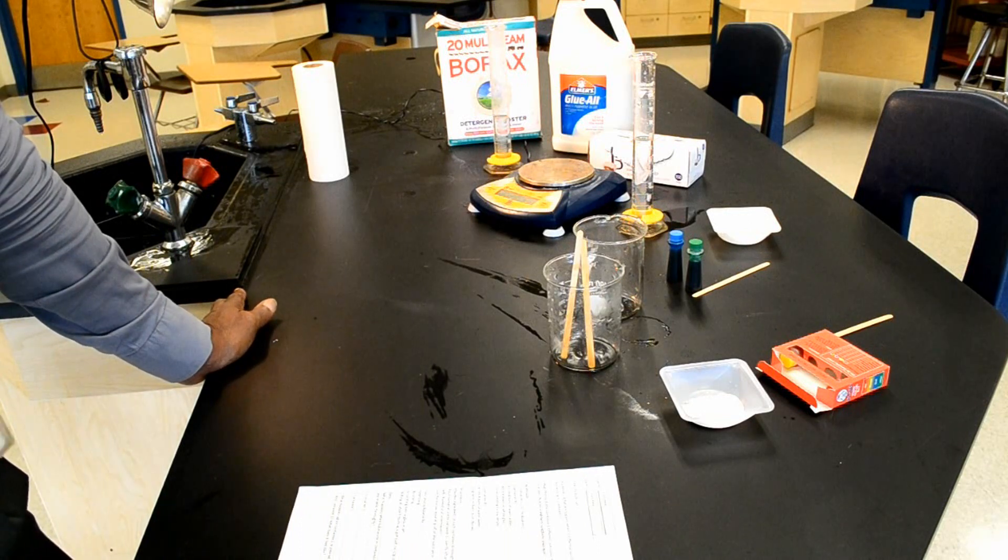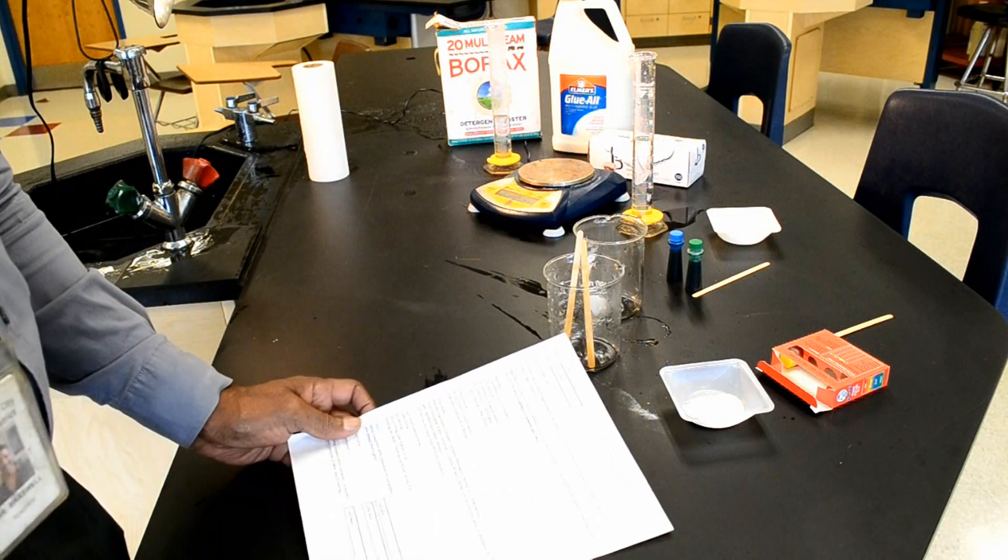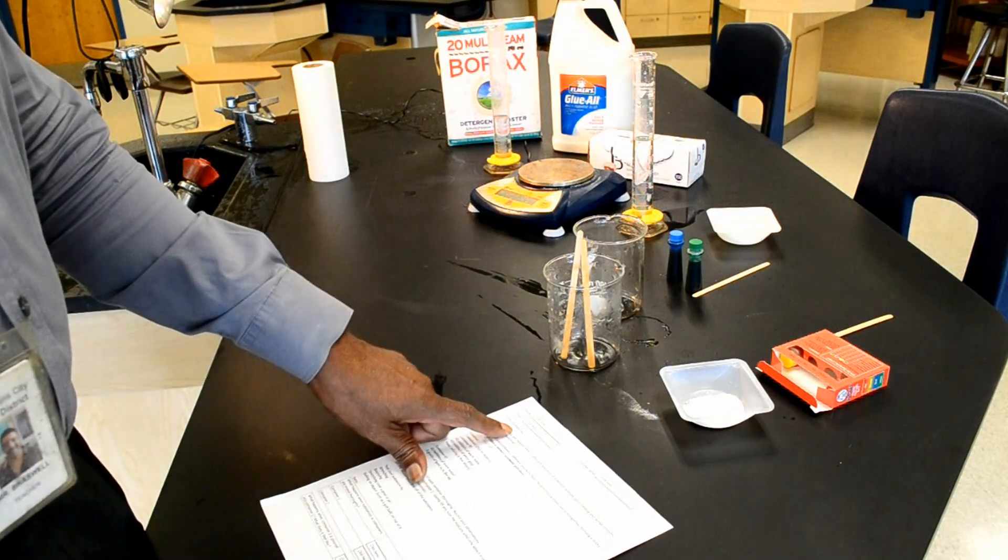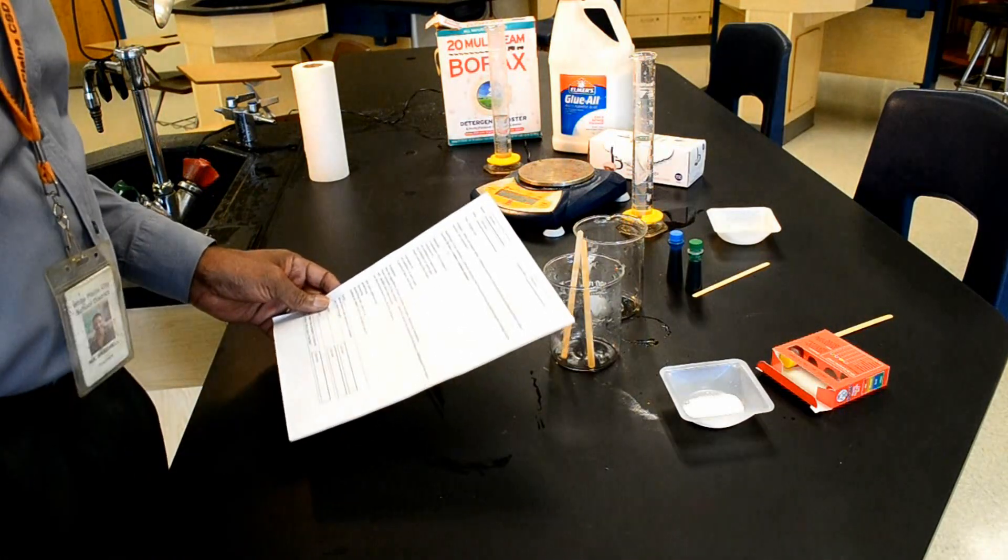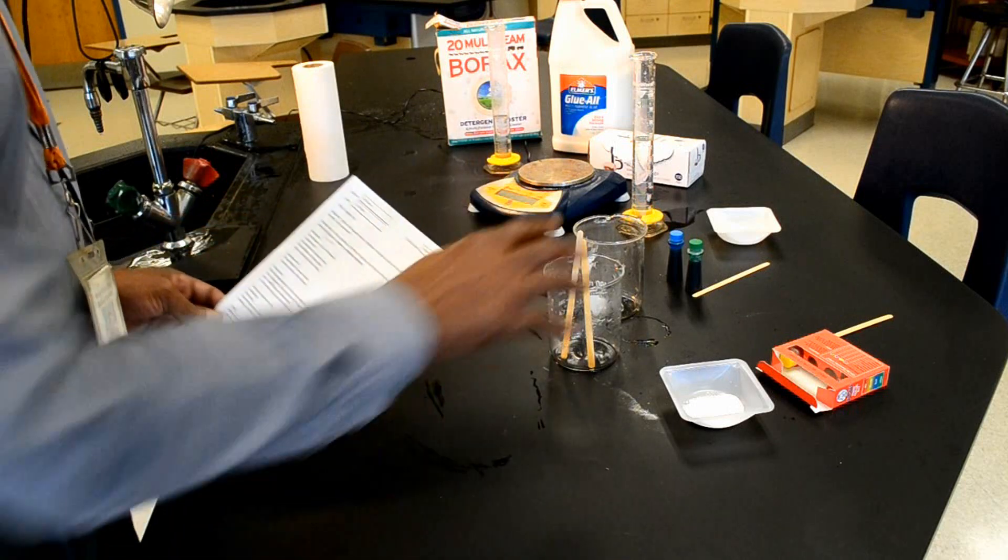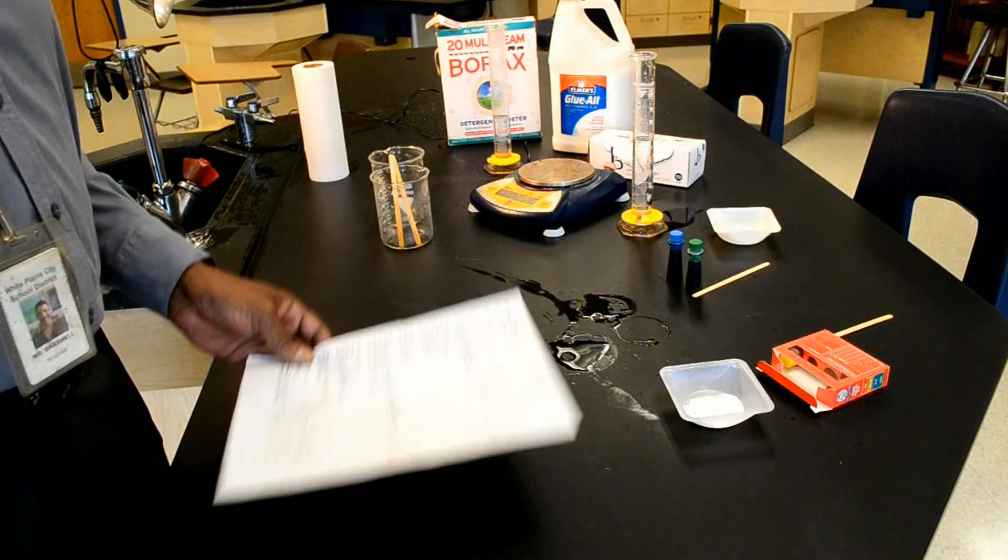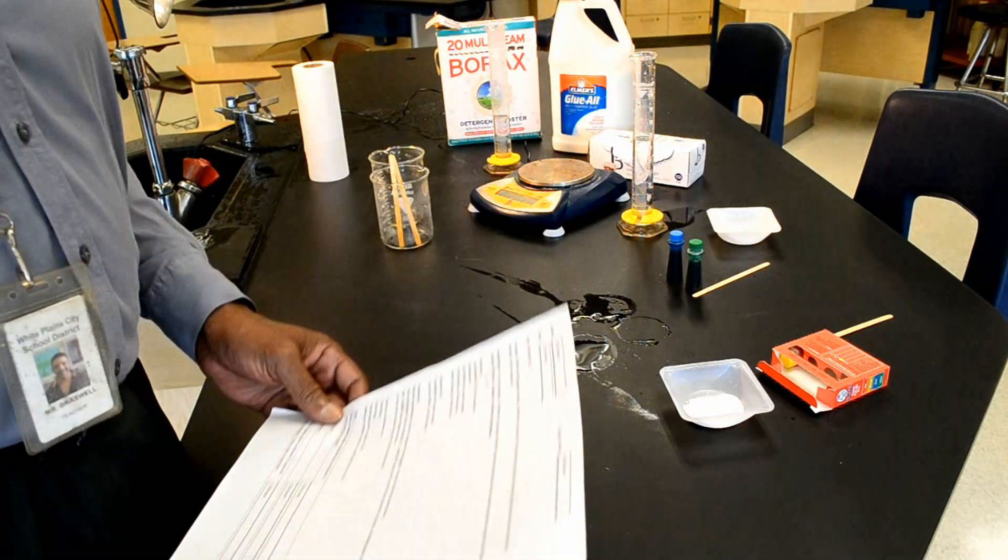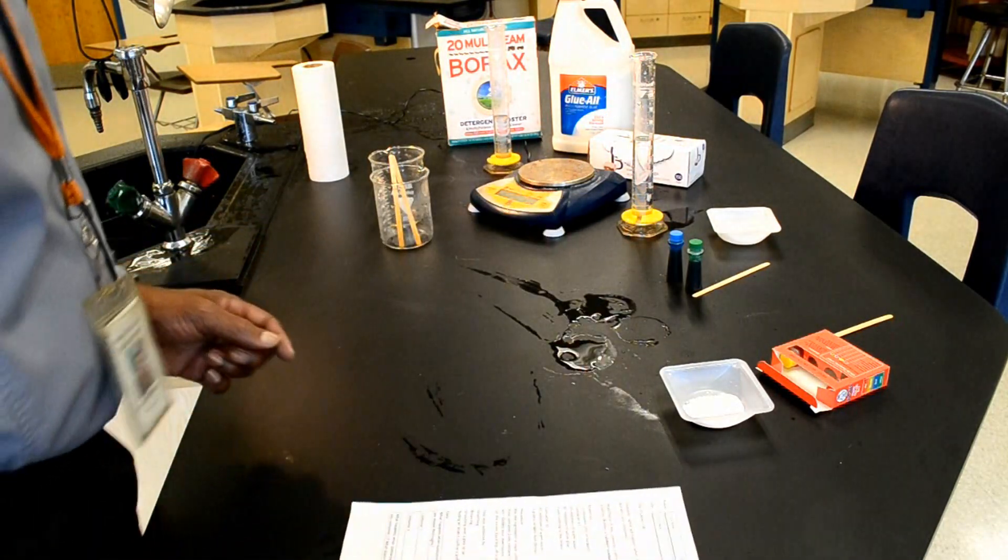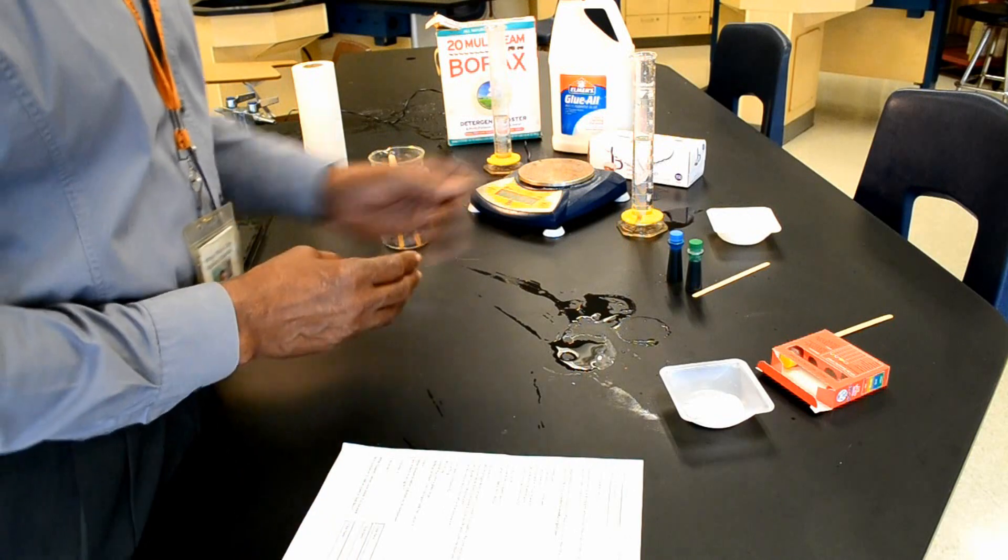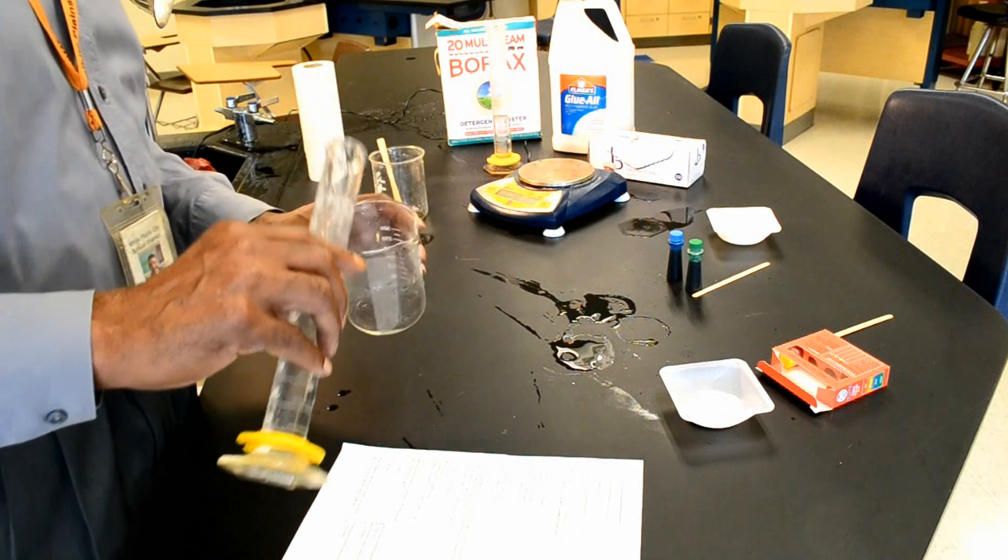To make the flubber, we must begin by using a protocol that is found on your lab sheet, the flubber lab. According to the flubber lab, we need two 250 ml beakers, but these beakers are actually 400 ml. It doesn't matter about the size of the beakers. And in container 1, we must place 65 ml of warm water.